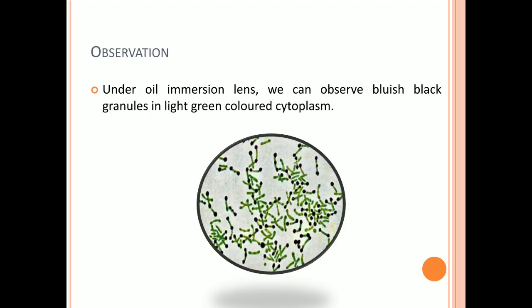Observation: Under the oil immersion lens, we can observe bluish-black granules in a light green colored cytoplasm.